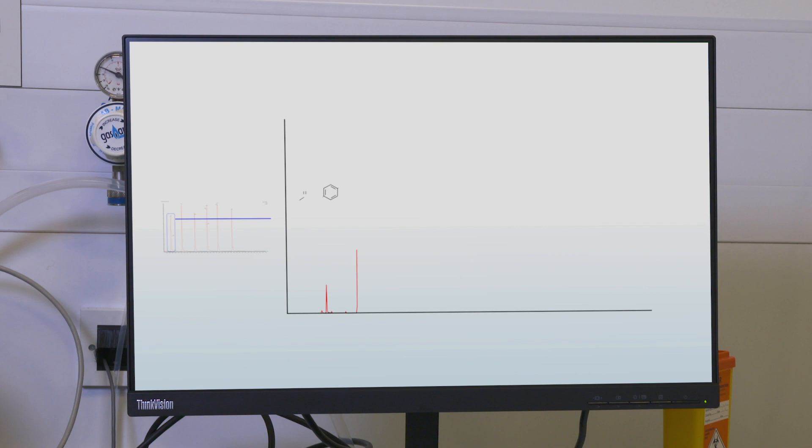Simple extraction of the spectra shows the status of the reaction, with subsequent analysis demonstrating reaction progress over time.